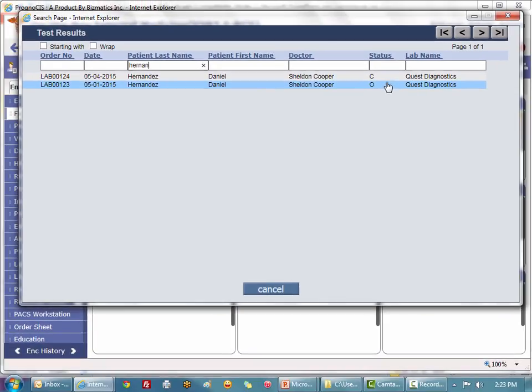If you, of course, had sent the patient to a patient service center with a paper requisition, maybe the patient hasn't done the test yet. Or if they did, maybe the HL7 interface is a mismatch. And that is why you need to make sure that you're working the import log in those scenarios. In any event, the one with the O does not have a result yet.